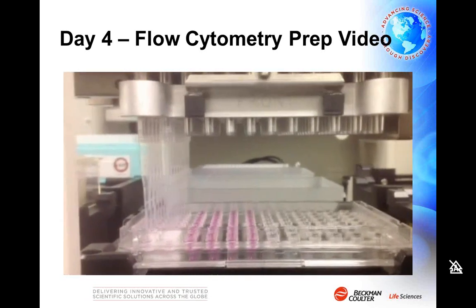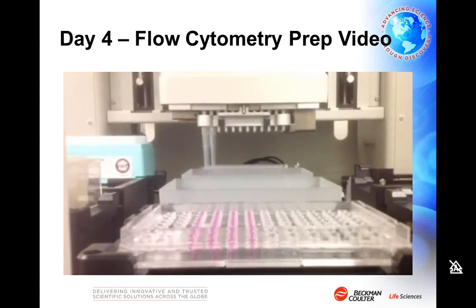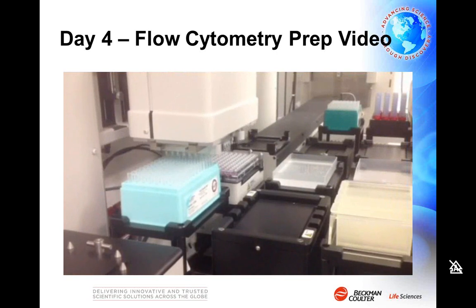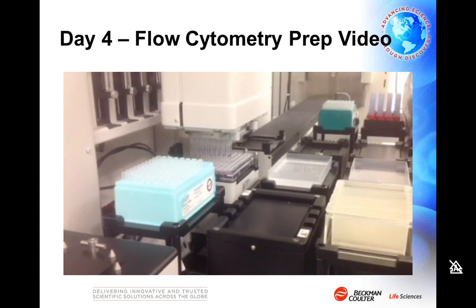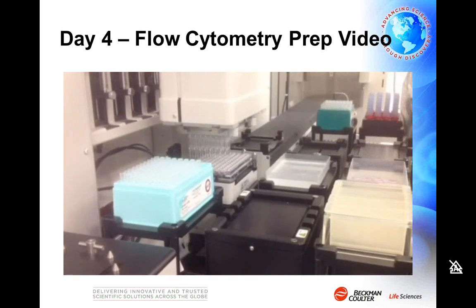This would mainly only get the last 1 or 2 spheres that hadn't been taken up out of the entire plate, dispense it back, and then basically we would remove the PBS rinse and the residual media, again using enhanced selective tip pipetting. Again, also aspirating from the side of the well very slowly so as to not aspirate up the spheroid, dispense to waste, and then add the Accumax solution.